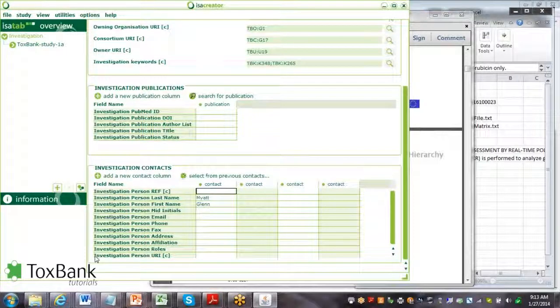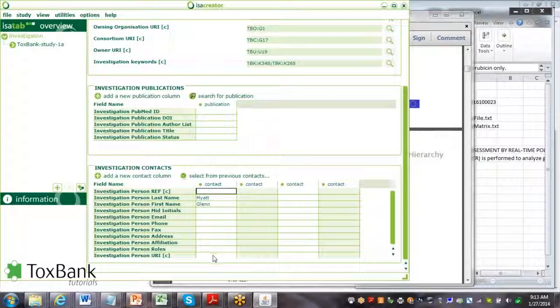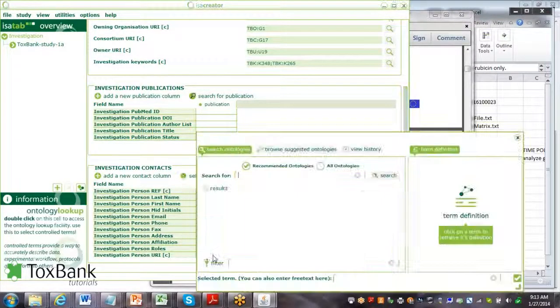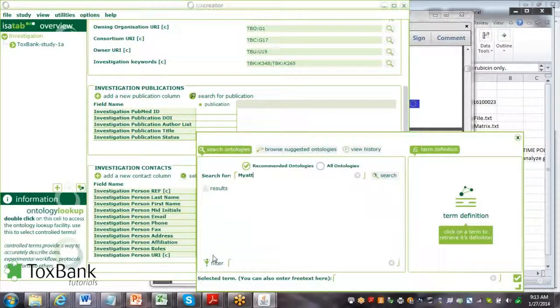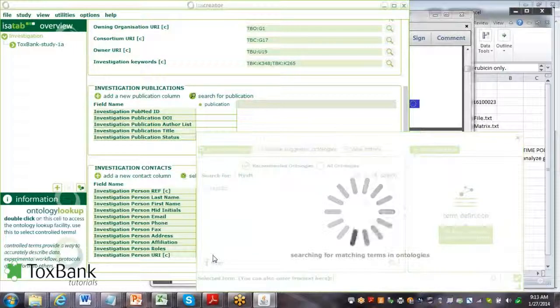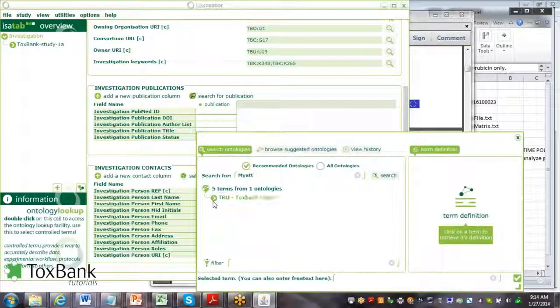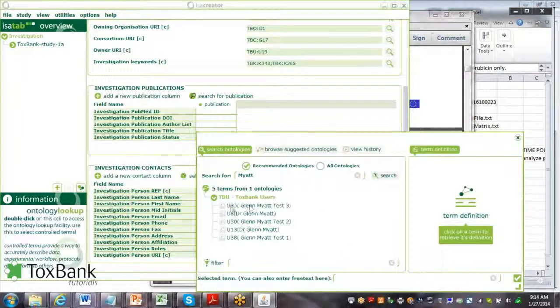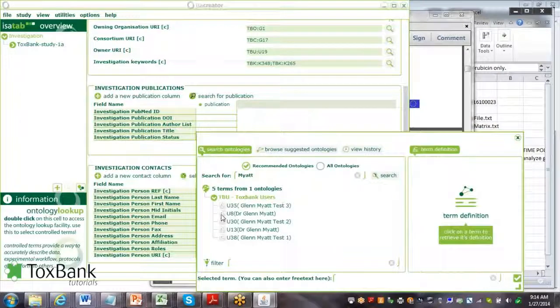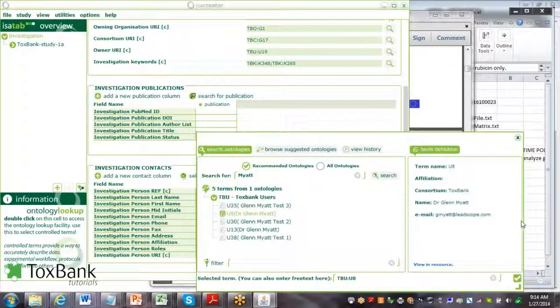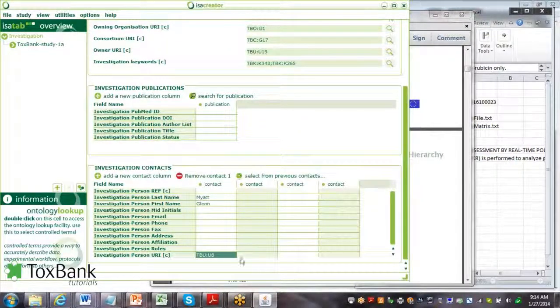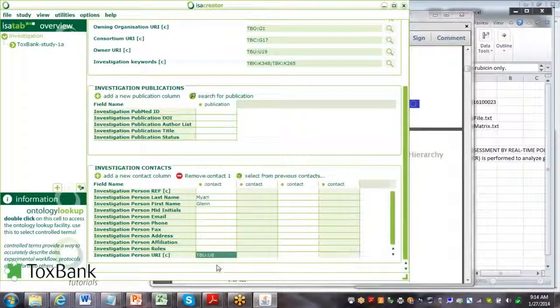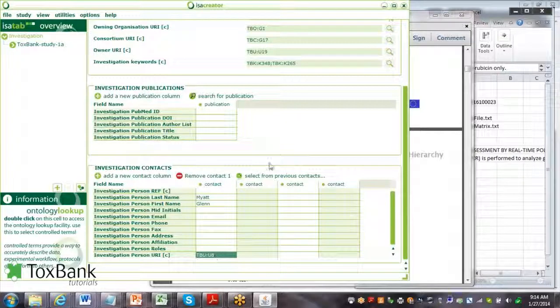But what's most important is the URI, which links it to the Toxbank warehouse. If we were to search on Myatt in the warehouse, we find here is a Myatt lead scope.